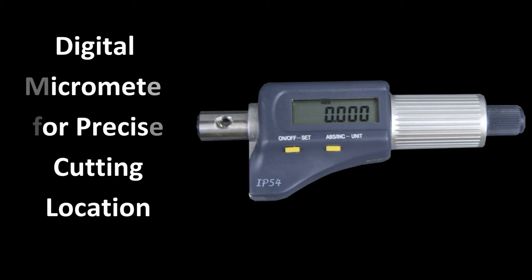For precisely locating the area of the cut, an adjustable micrometer is attached to the positioning shaft. The micrometer has a range of up to 1 inch.